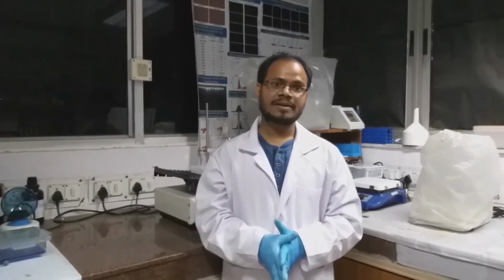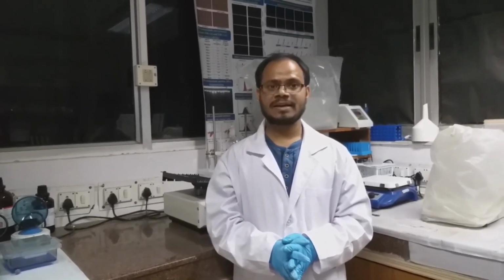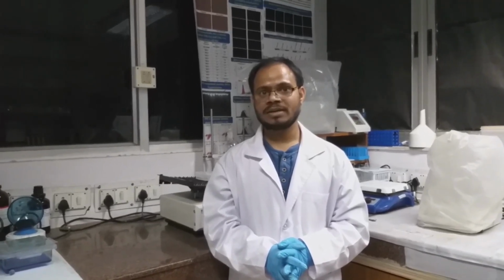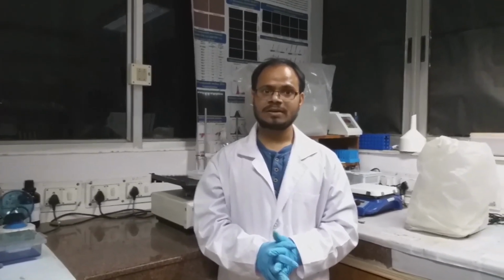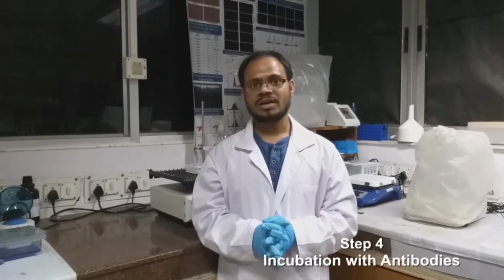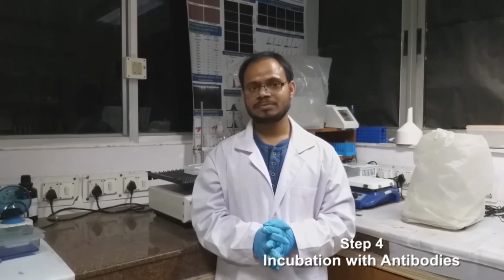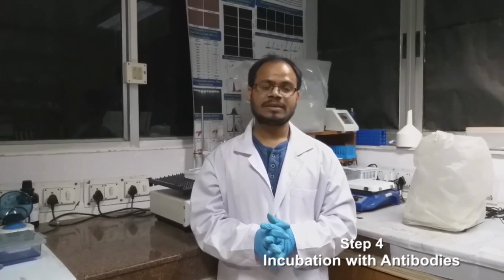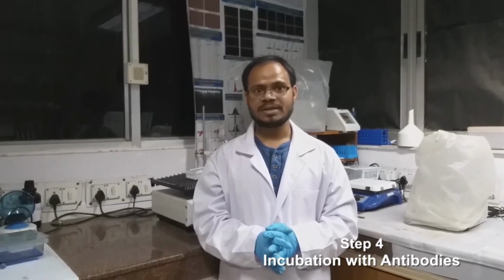Then incubate with a suitable secondary antibody for 5 hours at 4 degrees Celsius or 2 to 3 hours at room temperature. After that we wash properly at least 3 times. Then we develop the blot with the electrochemiluminescent substrate.